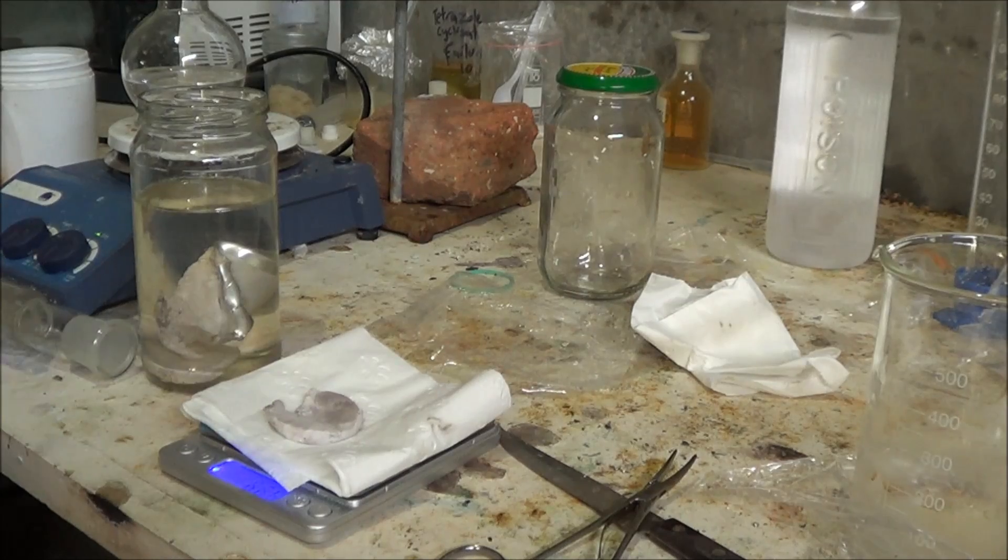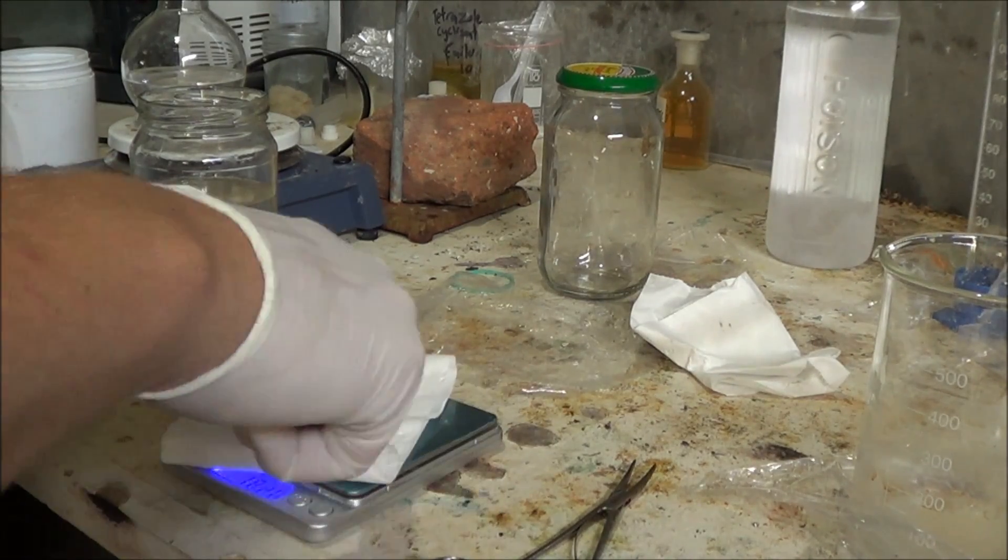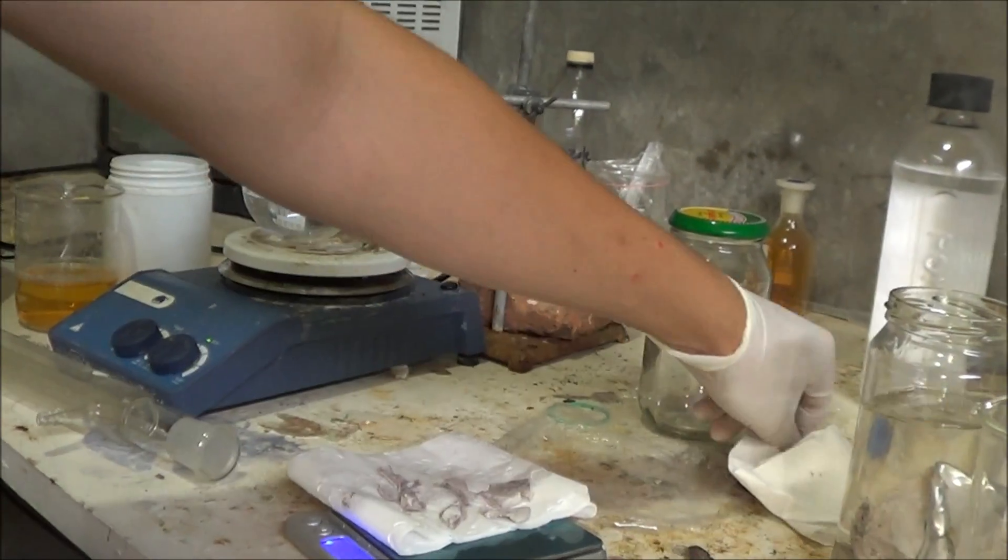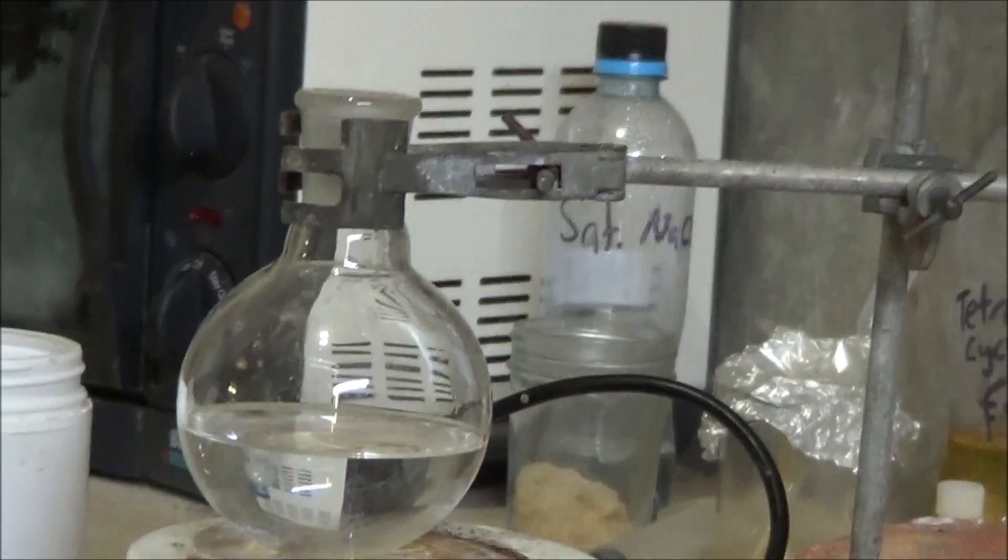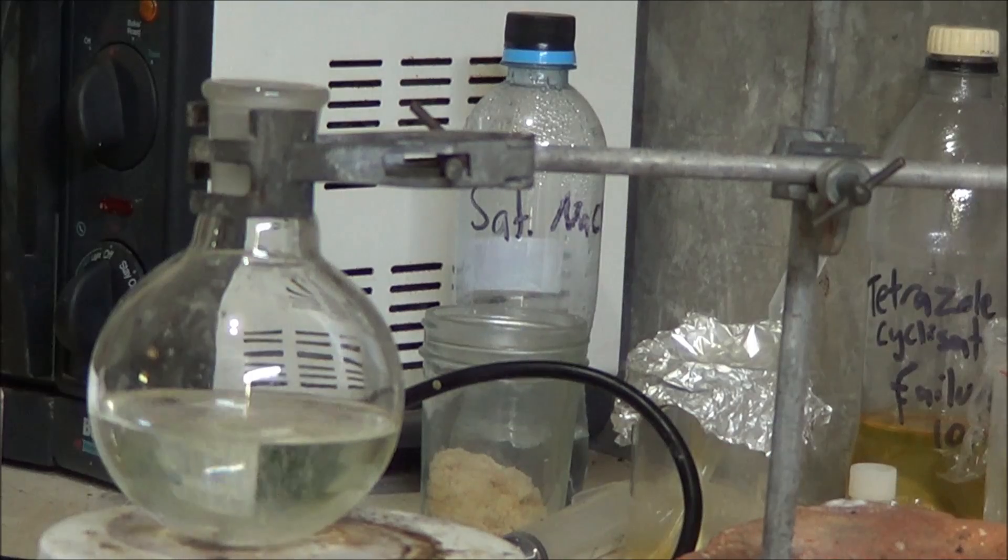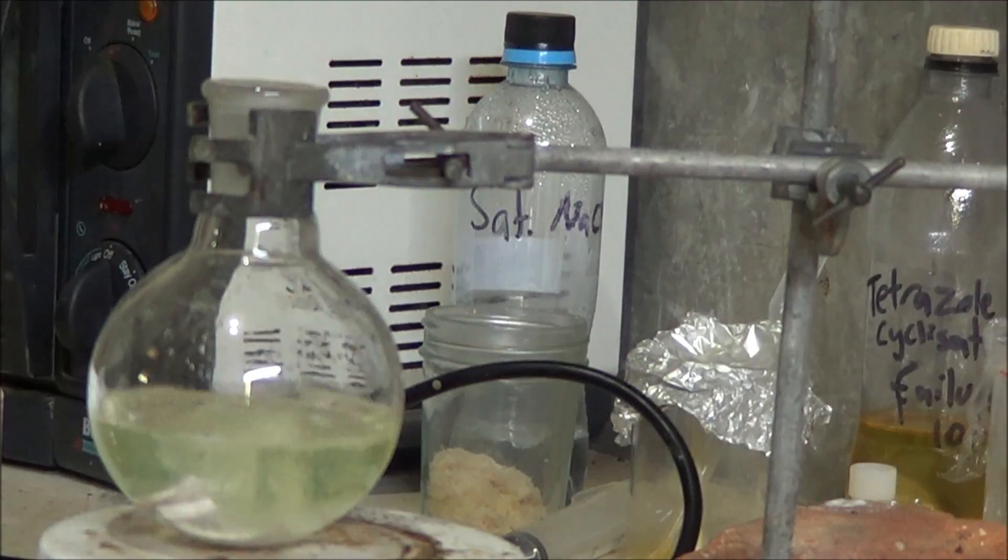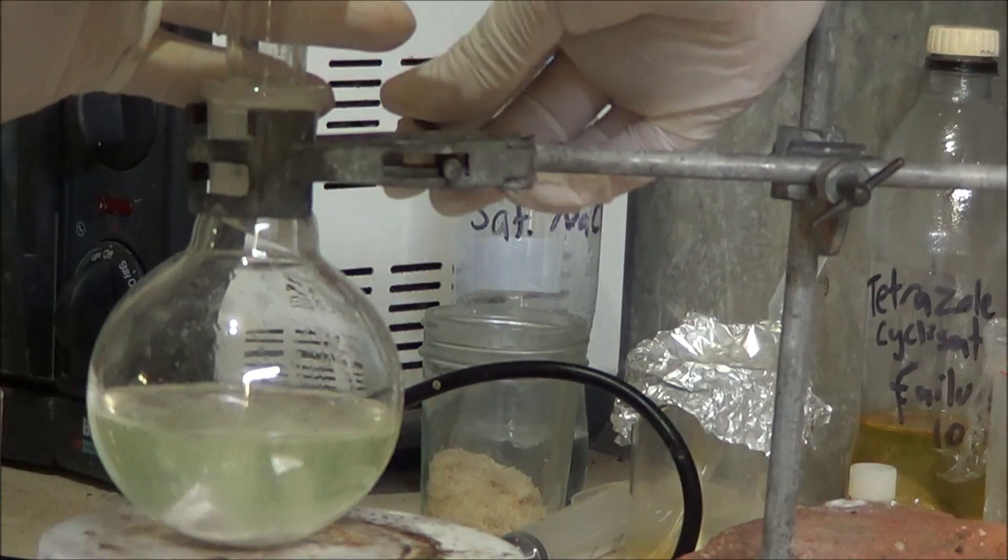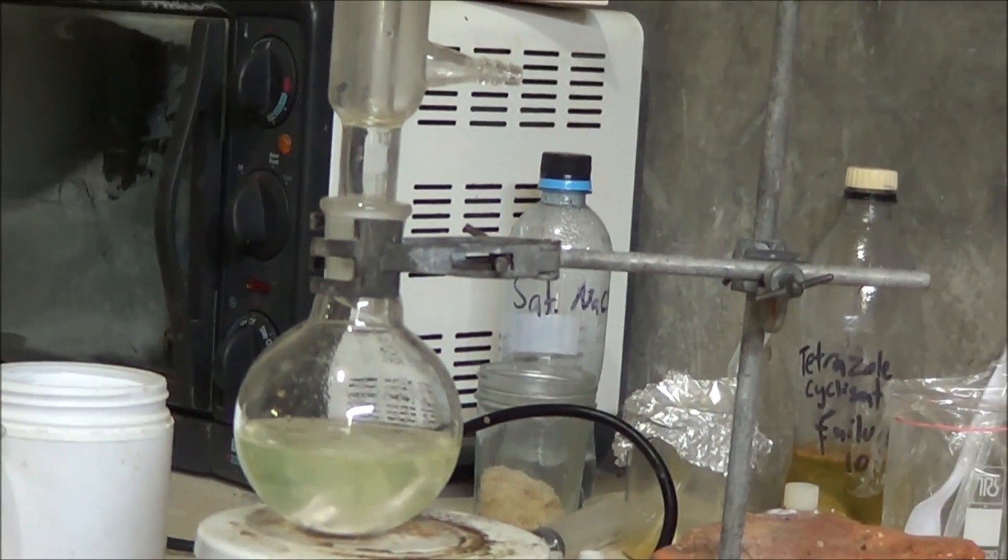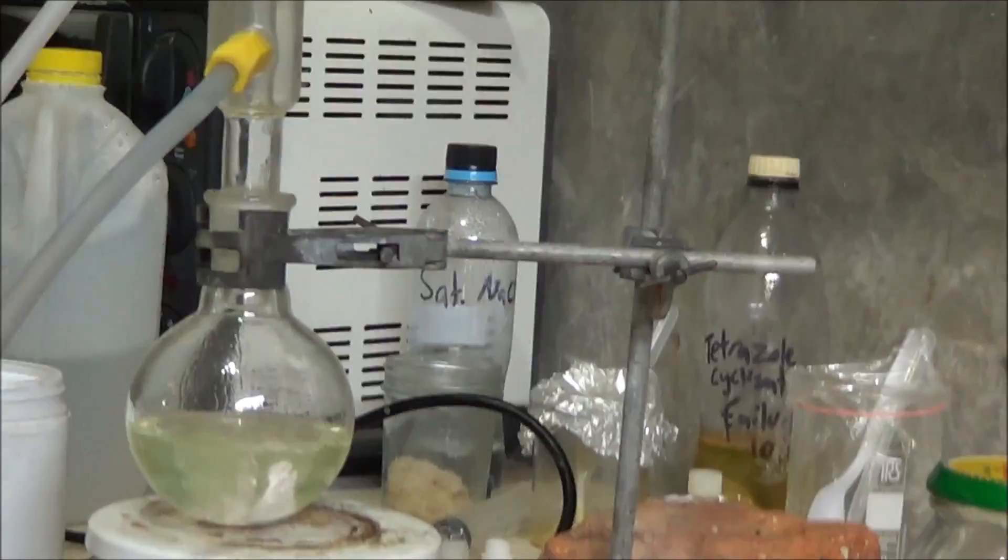This piece of sodium is 4.8 grams so we're just going to cover this up. Alright now we get to chuck in the ethanol. Put it back on. Put it back pretty fast here. Put it on. And then we'll hook up the water to the condenser, and yeah, alright.